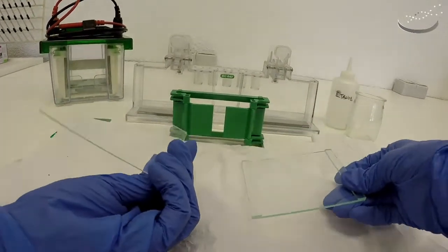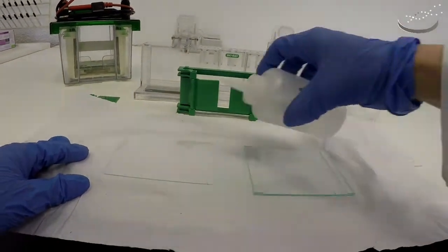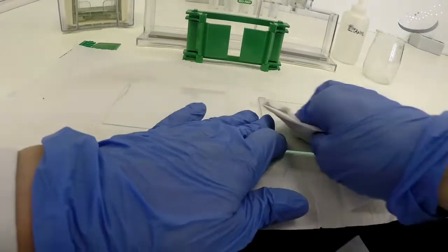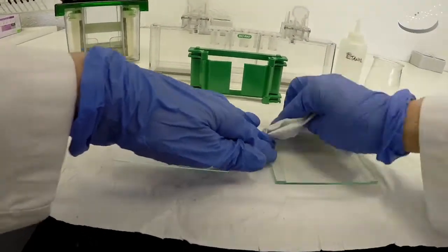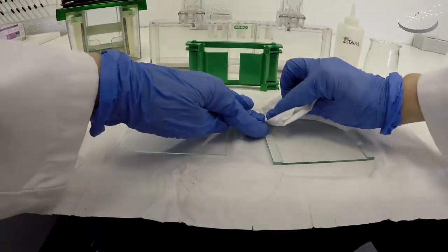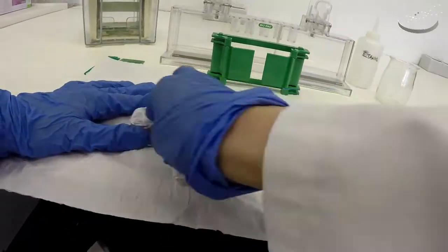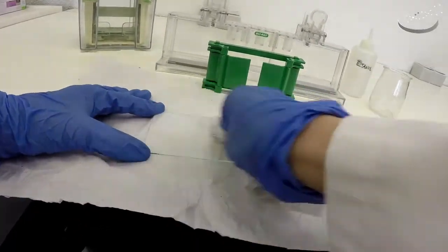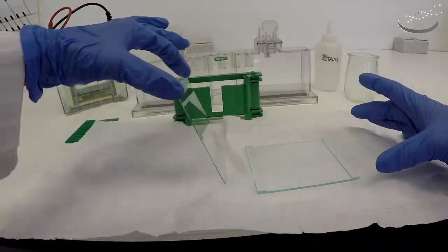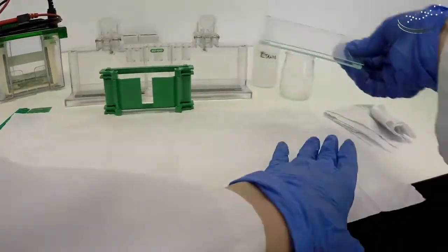The first step is to clean the plates. You should wash them with soap and water. For this video, we'll show you with just a few drops of ethanol. You want to clean them very well with a paper towel, and be especially careful to clean right next to the spacers, because this is where most of the time we get accumulation of polymerized or dry gel, and this is what we want to get rid of. We're also going to clean this face of the small plate — it's better to clean it with soap and water first and then ethanol.